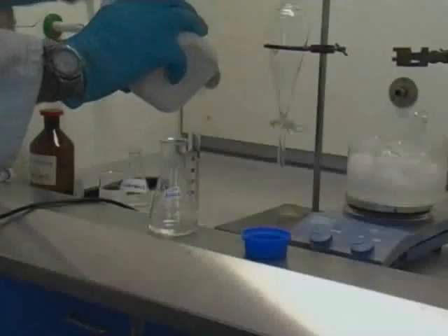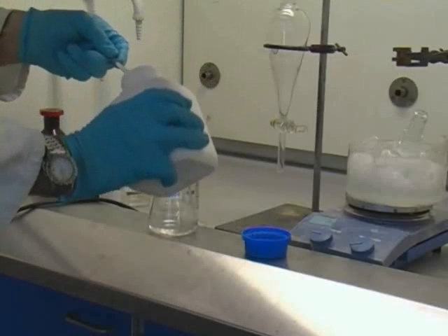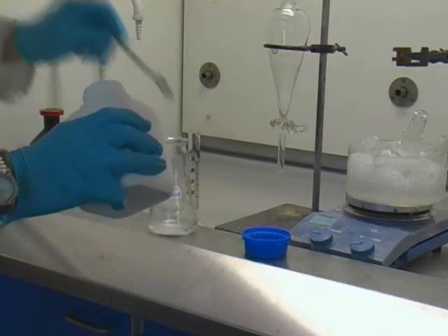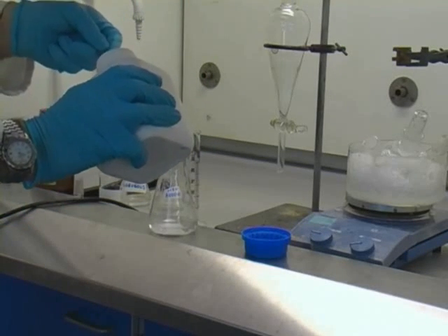Transfer the organic layer to a 250ml conical flask and add enough magnesium sulphate to mop up any residual water.